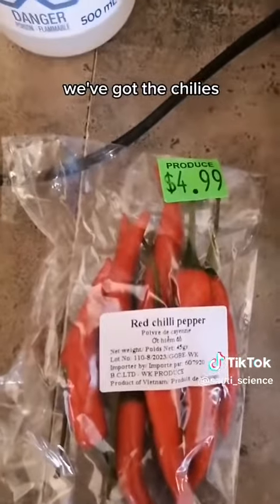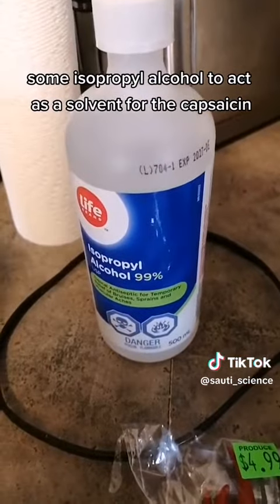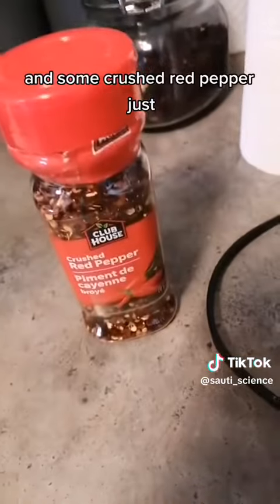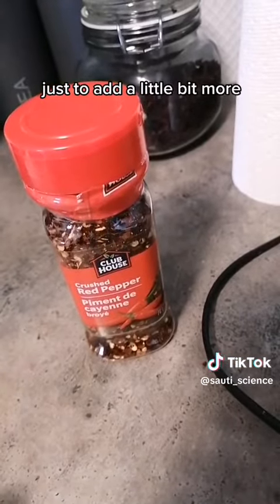We've got the chilies, some isopropyl alcohol to act as a solvent for the capsaicin, and some crushed red pepper — just to add a little bit more.